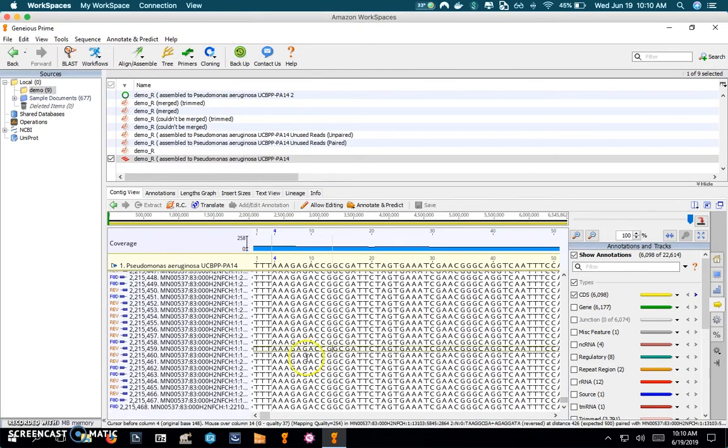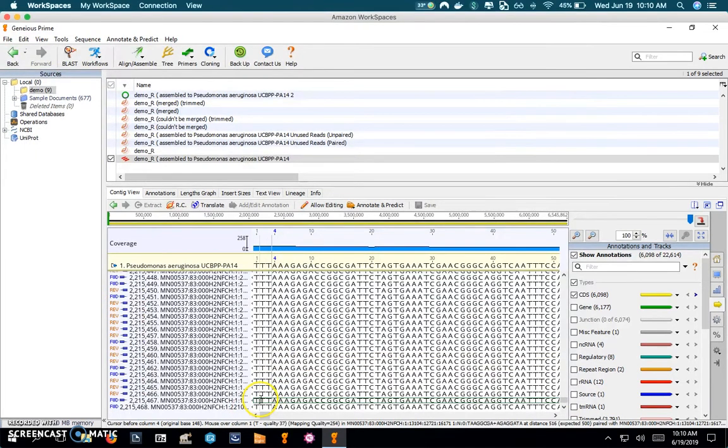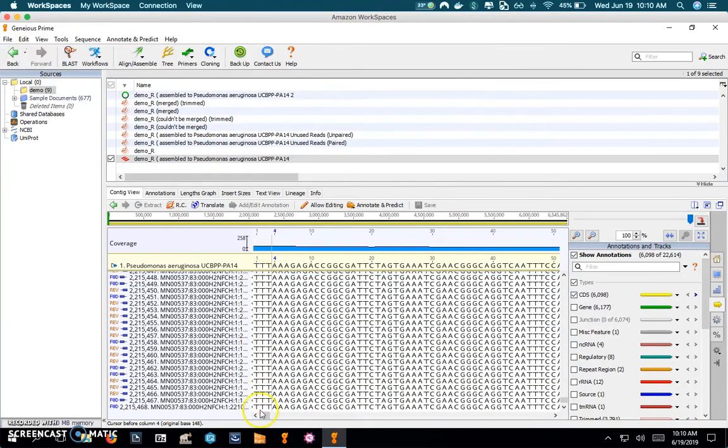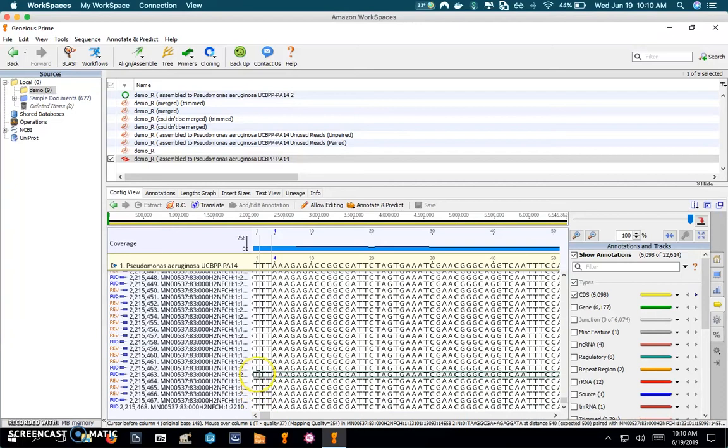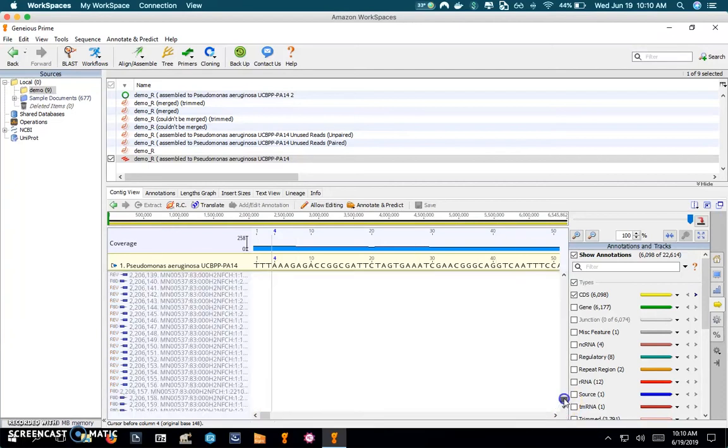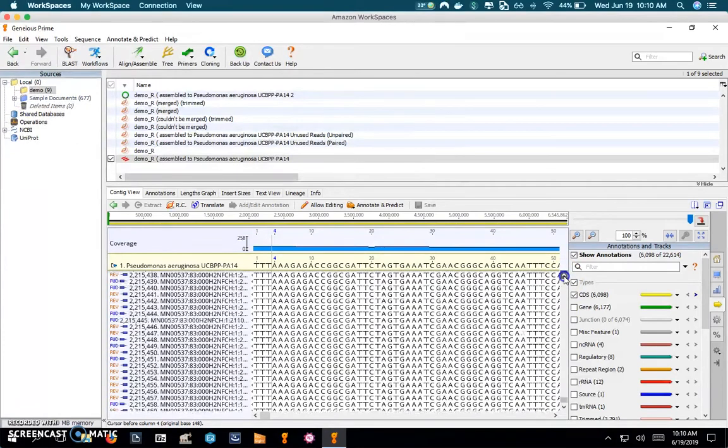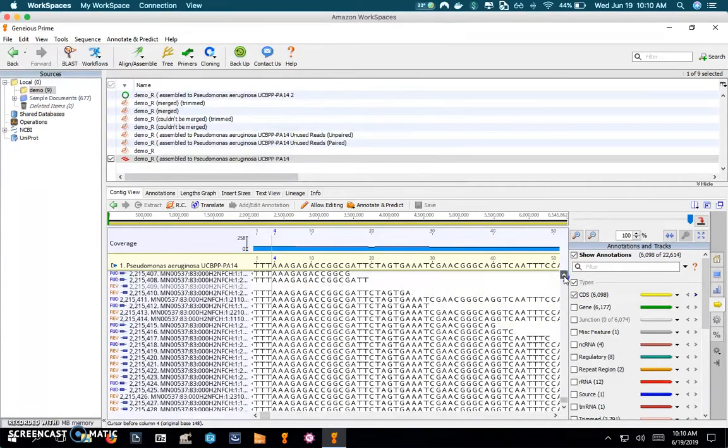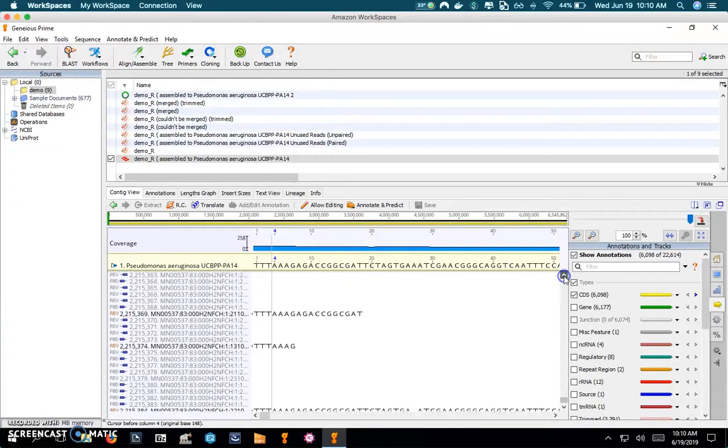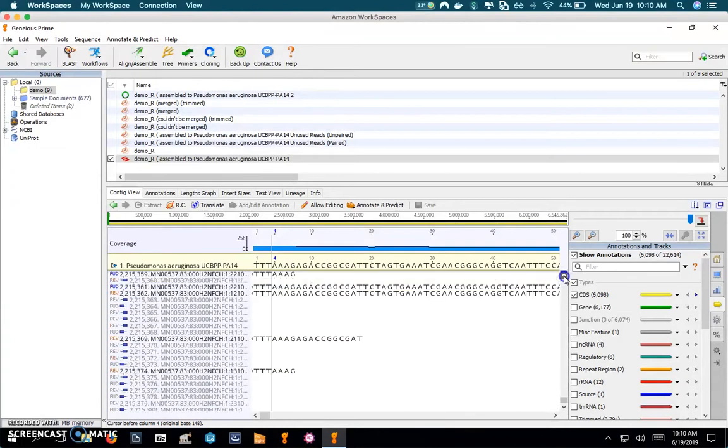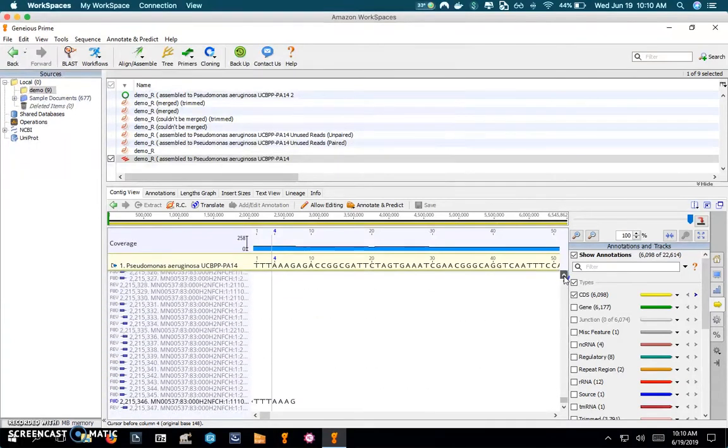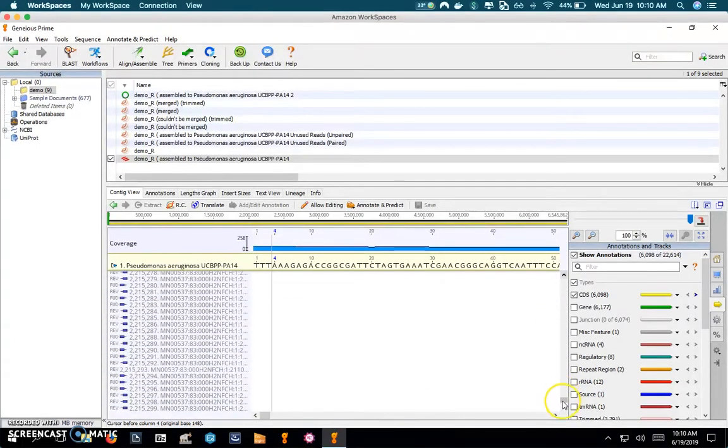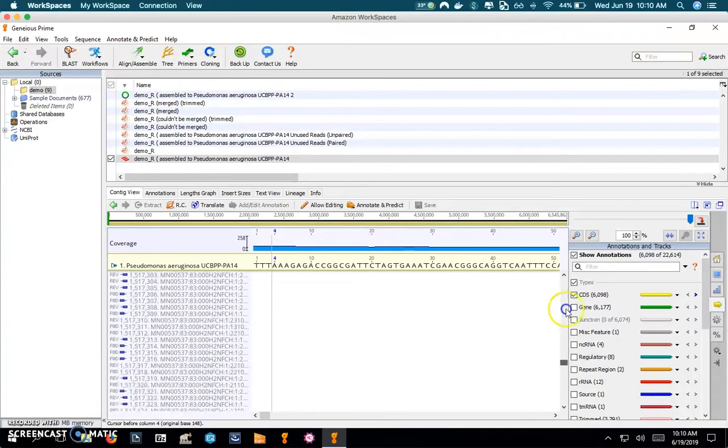I think it's all the way to the bottom here. There's another set of reads that are actually mapped along the first part of the reference as well. And you can see if we start counting these up, one, two, three, four, five and so on, I'll bet there's about 78 of those. If we were to add them all up, I'm not going to count them here, we'll just take their word for it. It looks like if you added up all the reads at that first locus is probably 78.